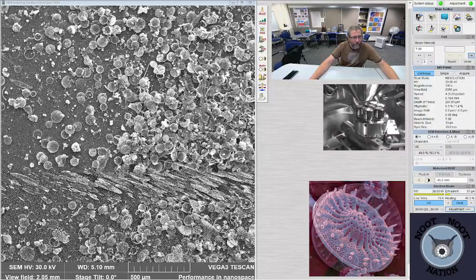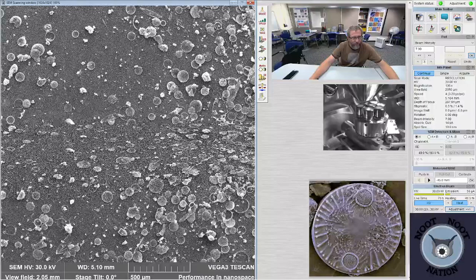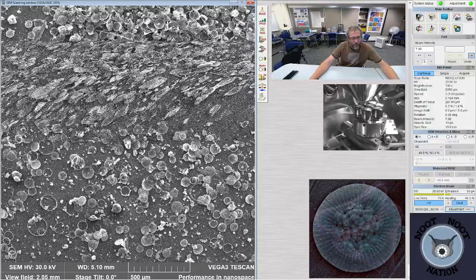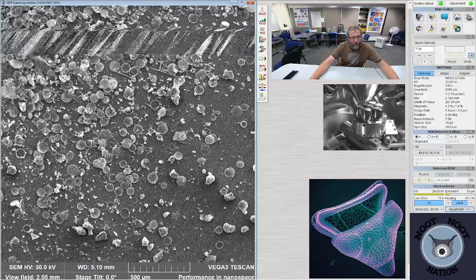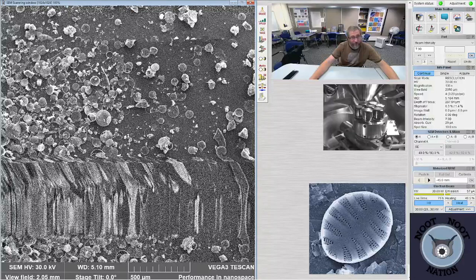Look at the difference between those two samples. Those must have been the live ones, and these ones are processed. You can see how it gets rid of all those lumps of things, and now it's just diatoms everywhere. The whole slide, basically diatoms. Got rid of all the poop, basically, which is what the processing did. And now we just see like a pile of round things.